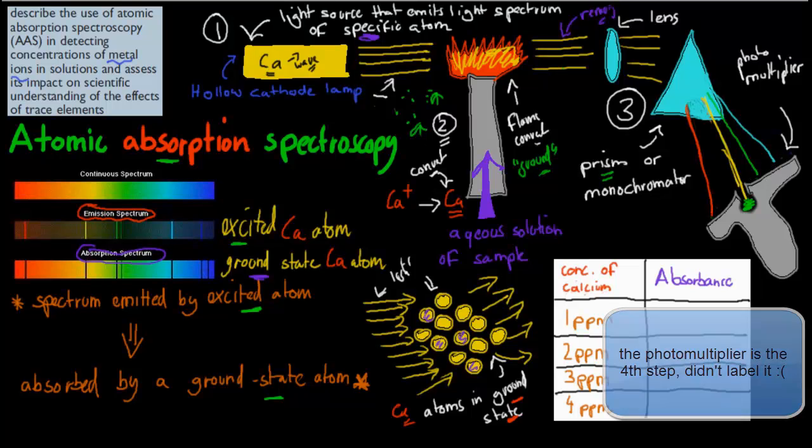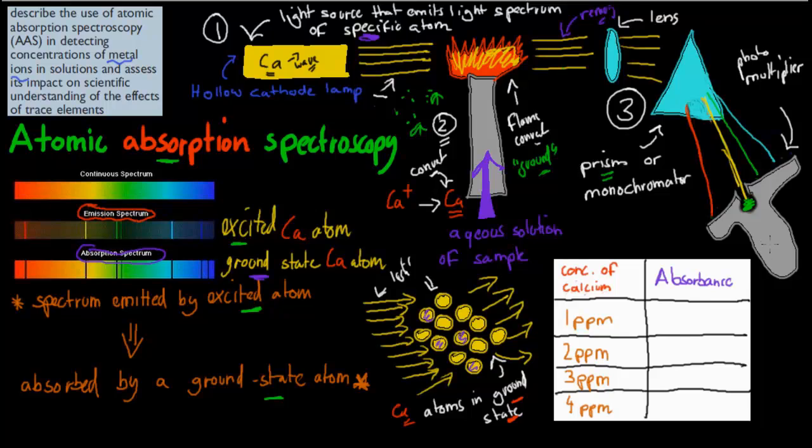So let's say for this sample, it's told us there is 0.1. This is the reading we get, 0.1. This happens at the photomultiplier. And now we've basically completed the whole thing. I'll explain how we can use all that to figure out how much is in a different sample, because that value doesn't tell us too much. But once we test it for concentrations we know, it does.